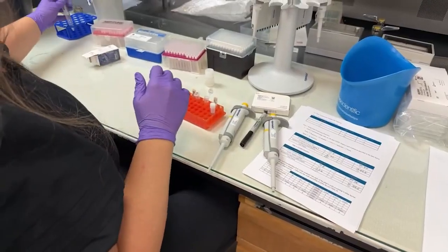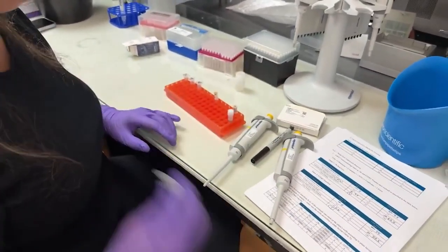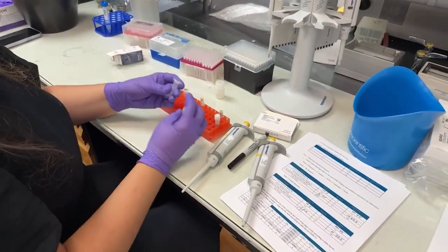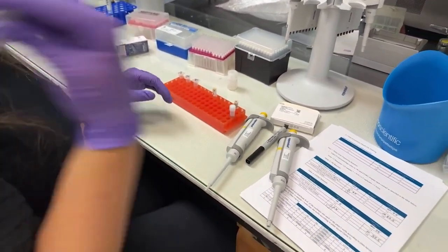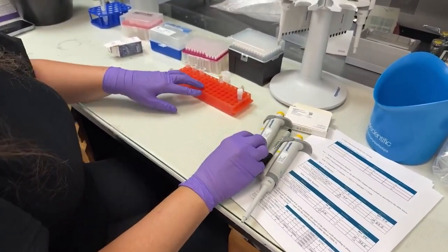Excellent. So now we are well on our way to getting this reaction completed. For each of these, we have done 3 pipetting steps. It's not a lot, really. There's a lot more difficult processes in the lab for sure.